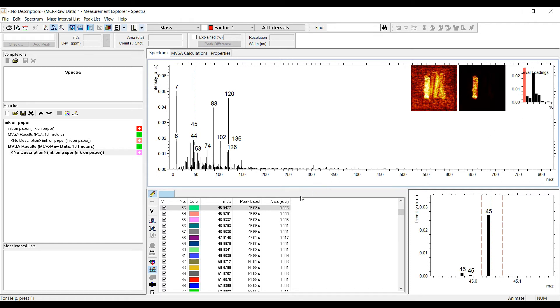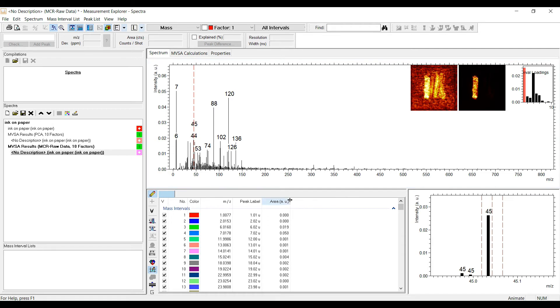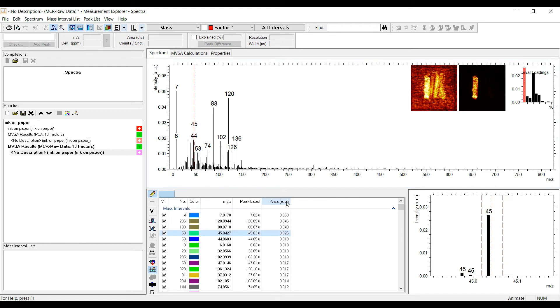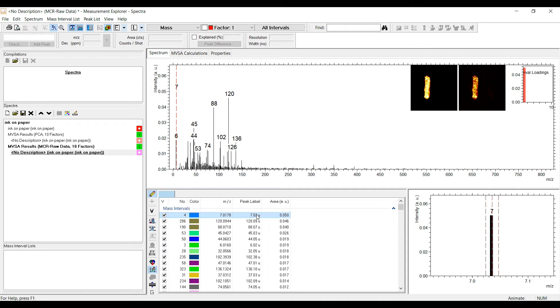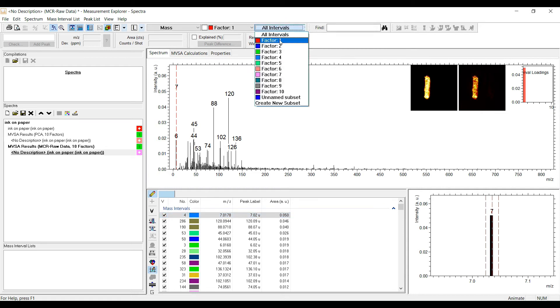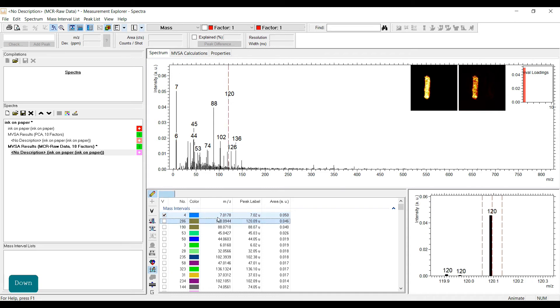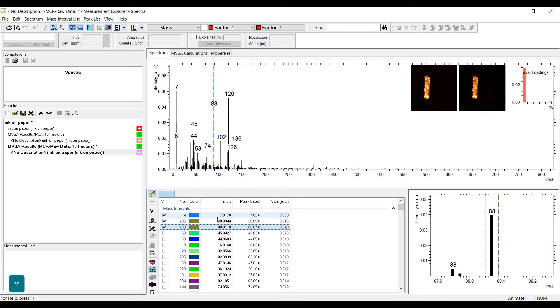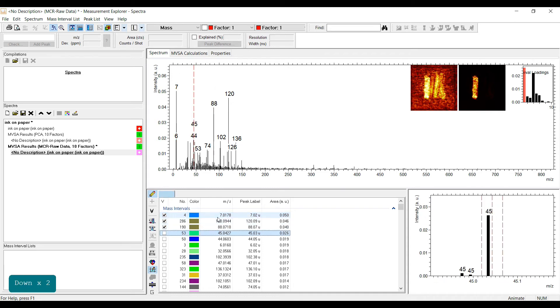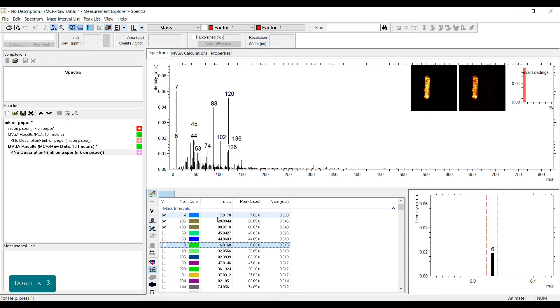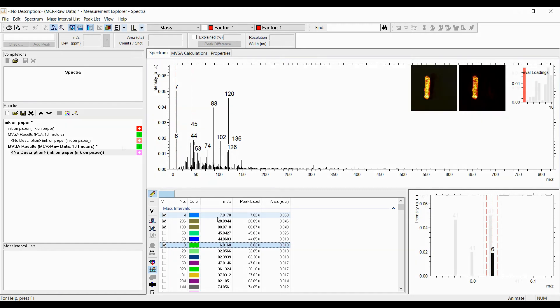In the peak list, you may also sort the intervals along their loadings by clicking onto the area table header. This allows quick access to the most significant masses for the selected MVSA factor. To tag mass intervals for further analysis, the mass interval subsets function is perfect. For the selected factor, use the respective subset from the list, select the masses of interest from the loadings plot or the peak list, and press V to add the mass interval to the subset.